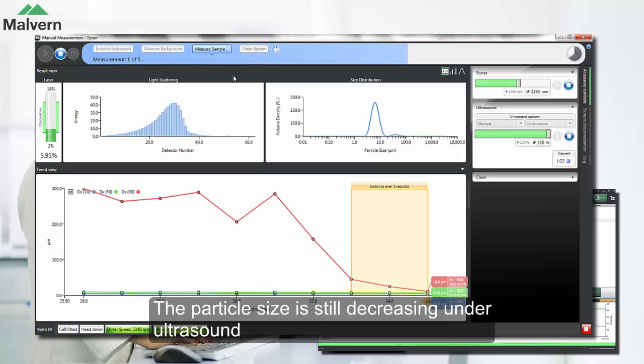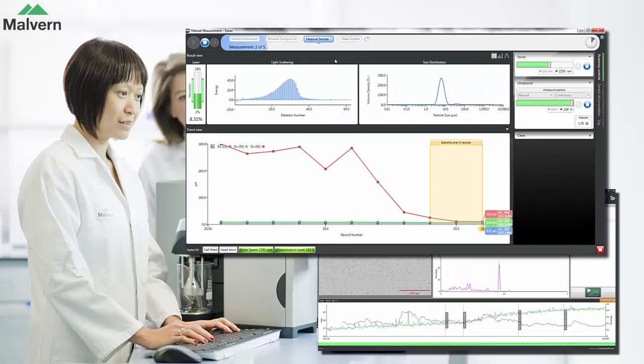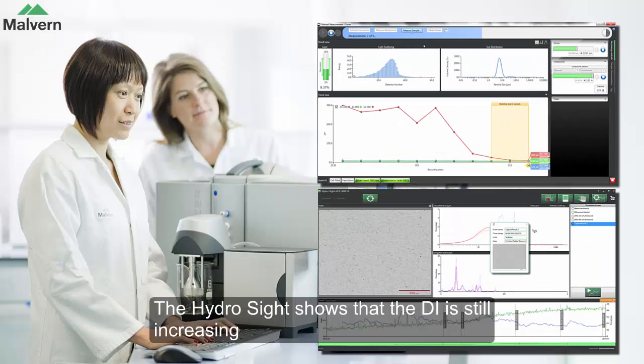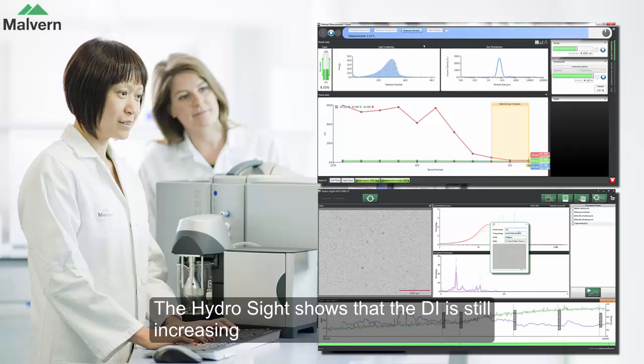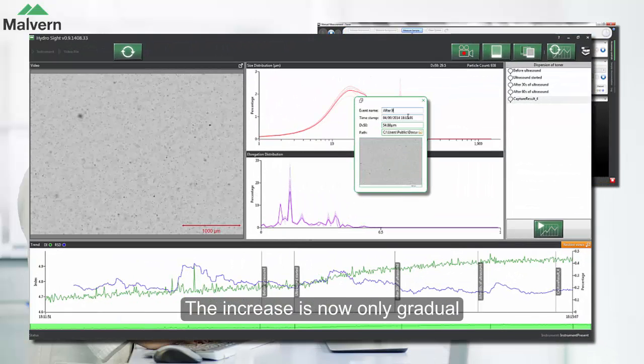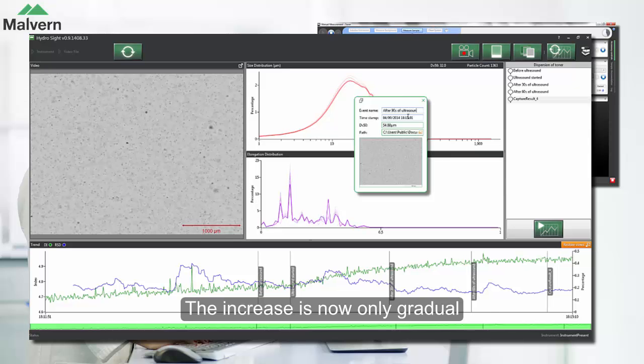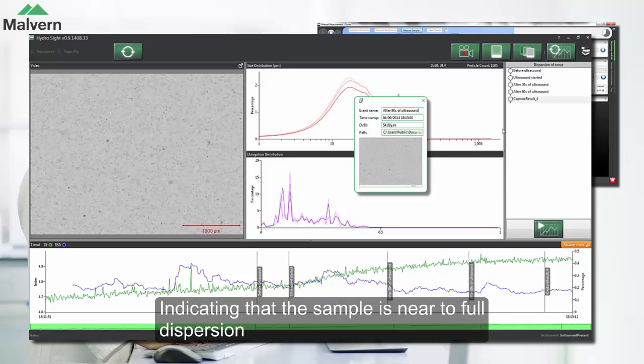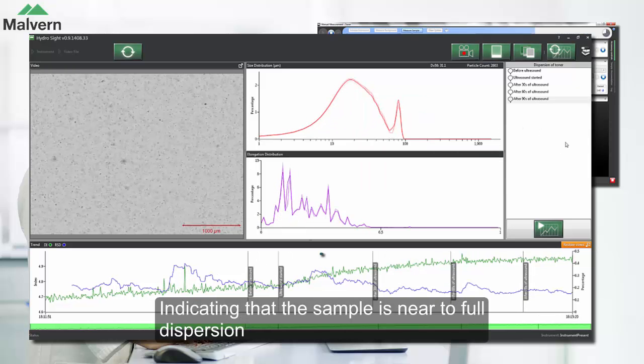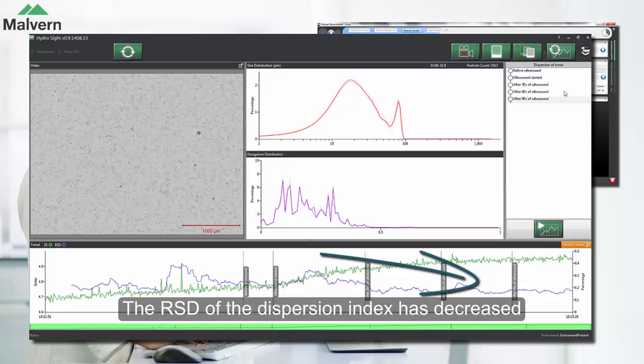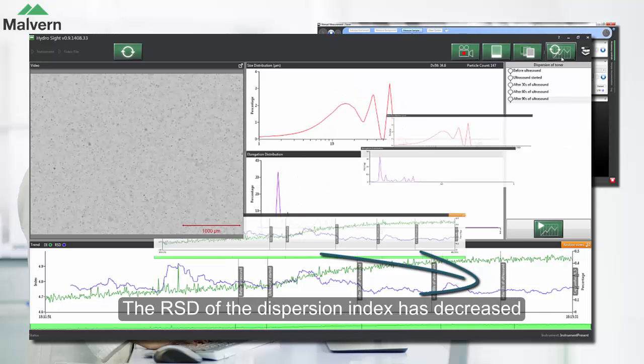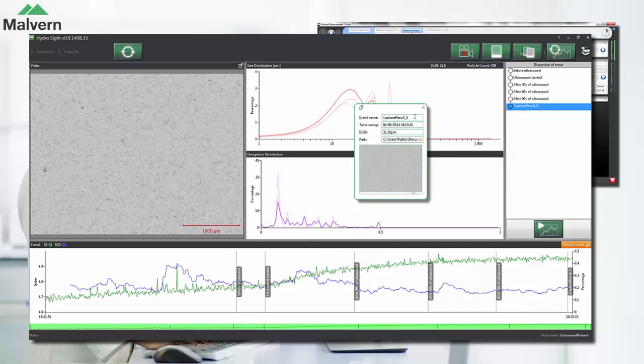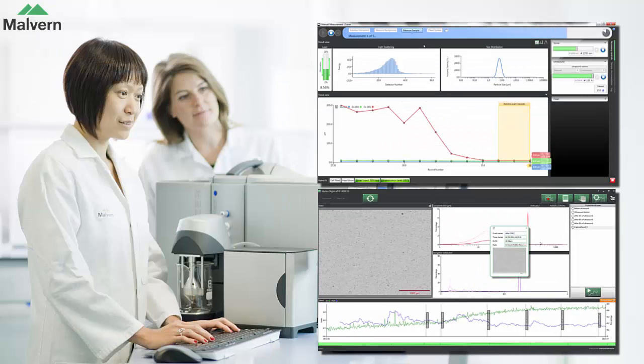In that second set of measurements, we can see that the particle size is still decreasing under ultrasound. When we look at the HydroSight software, we can see the dispersion index is still increasing, but only gradually, so that indicates that we're probably near to full dispersion of the sample. The RSD of the dispersion index has decreased. This indicates that there's less variation from frame to frame, which suggests that the dispersion is stabilizing.